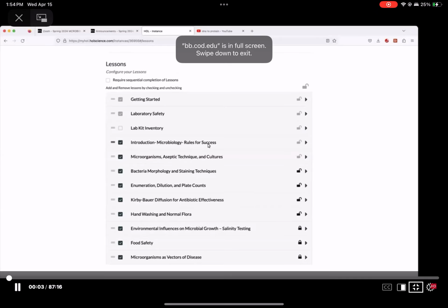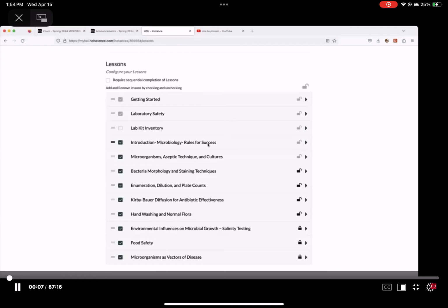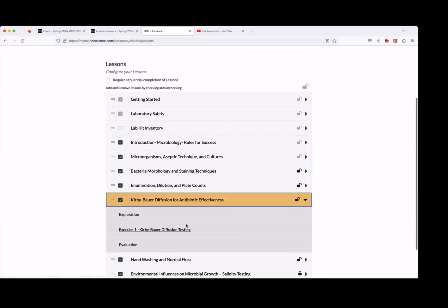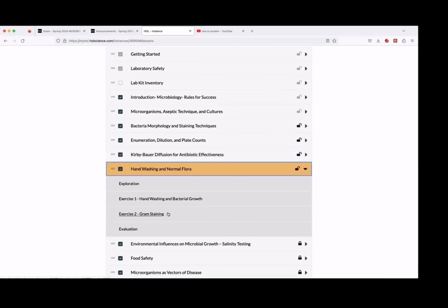Talk about this little lab, and then I can switch back to the chapter review of DNA. Okay. So in this one particular experiment here, we pour two plates. One we use for three different antibiotic discs to see the diffusion of those antibiotics and how they can kill bacteria differently. Then the second plate, it's a very easy experiment. What we do, we wash our hands. So we check the effectiveness of washing hands.